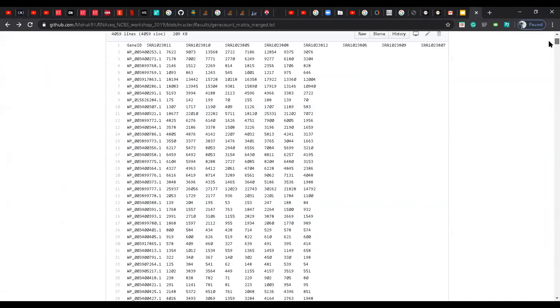Yes. Yeah. So basically, I'll just update on what we have done so far. We had taken the raw reads, the FASTQ files, which had your reads which came out of the sequencer, along with the quality scores.